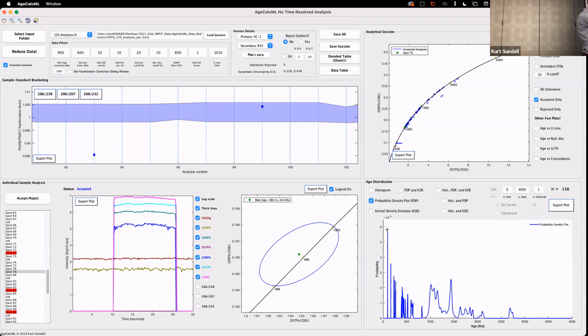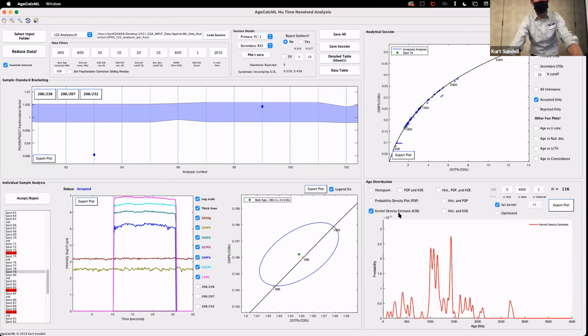It's like, okay, well, yeah, but it's not about the height of the peak, it's about the area under the curve. These are normalized to 1. And so I encourage you to read that paper and see for yourself or make a decision for yourself. But I agree, I think this leads to misleading results, where you have very spiky young dates and very kind of more washed out dates with the older part of the spectrum. The exact opposite occurs with the plots that Wei showed, where you get this washed out, over-smoothing of the KDE. And absolutely, that is the trade-off.